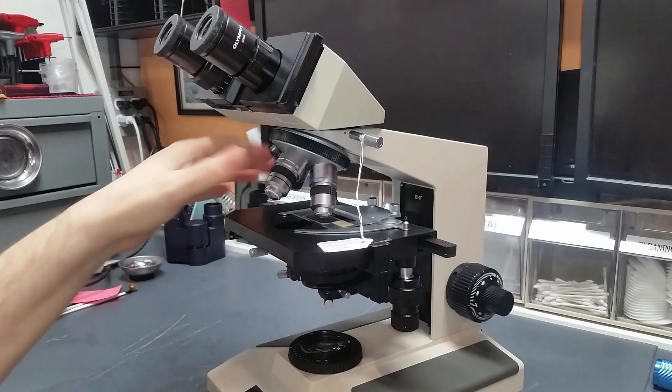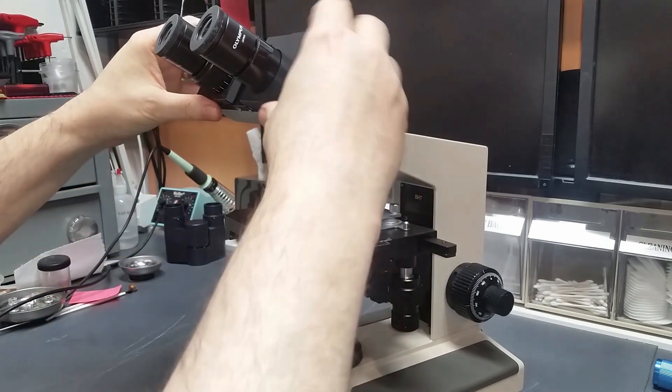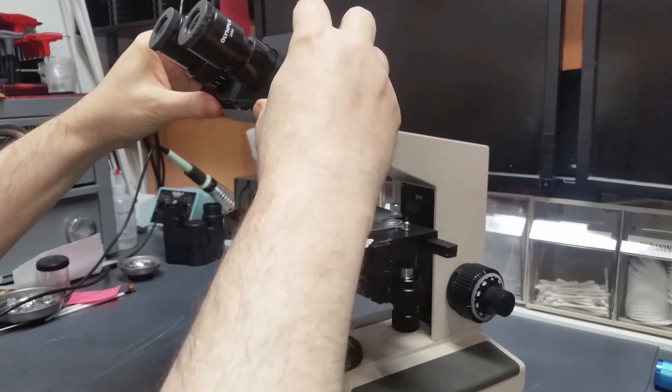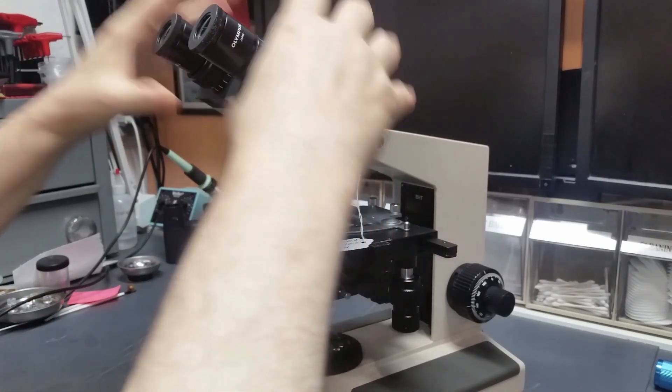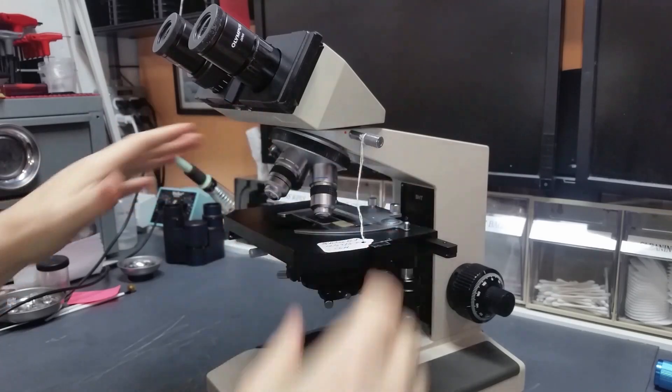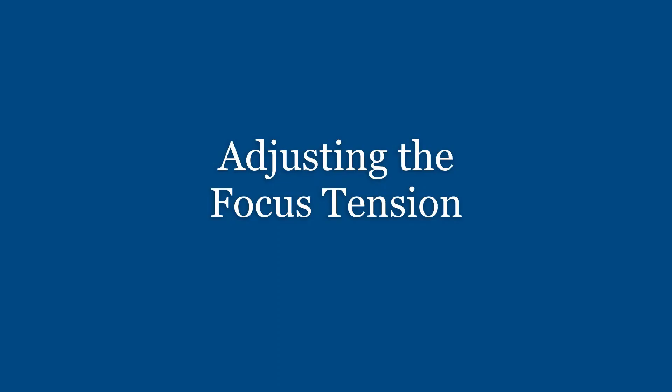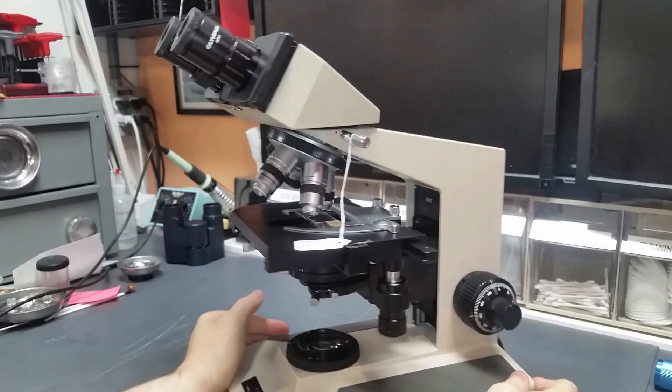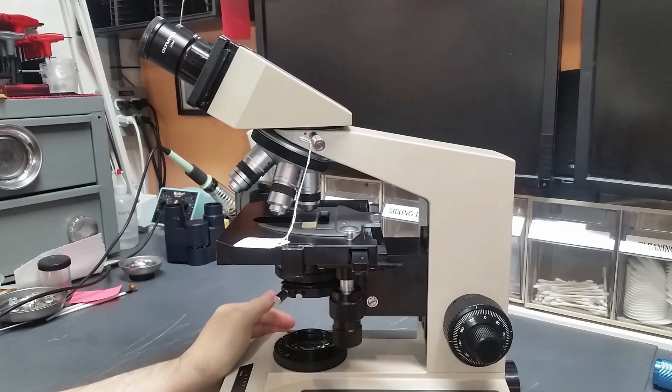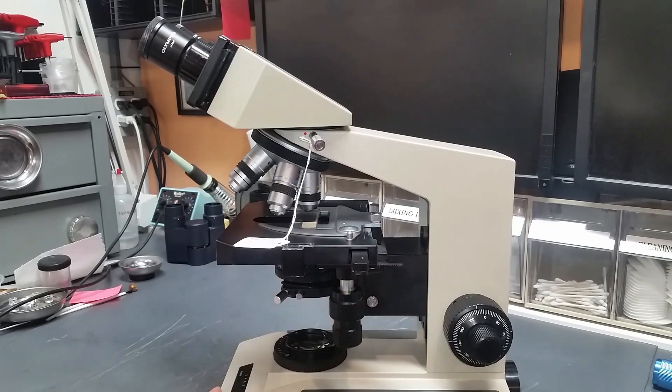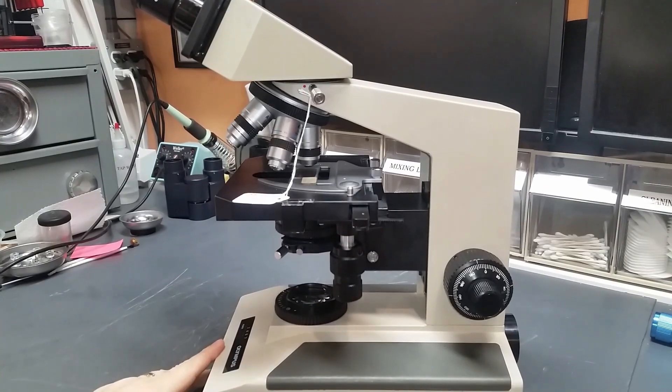I just got it out to do a final checkup, make sure that everything is working, all the optics are good. I wanted to show you a couple things I do as far as alignment checks on these scopes before I send them out.